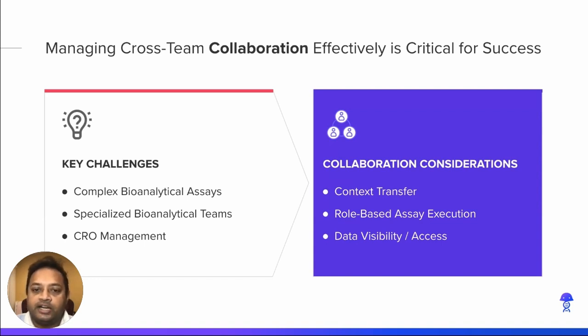In addition to this internal collaboration, most teams also have extensive collaborations with CROs providing bioanalytical services. A good digital solution should help manage this complex collaboration. It should enable easy context sharing between team members, facilitate role based collaboration, and provide data management tools to manage varying degrees of access depending on role.